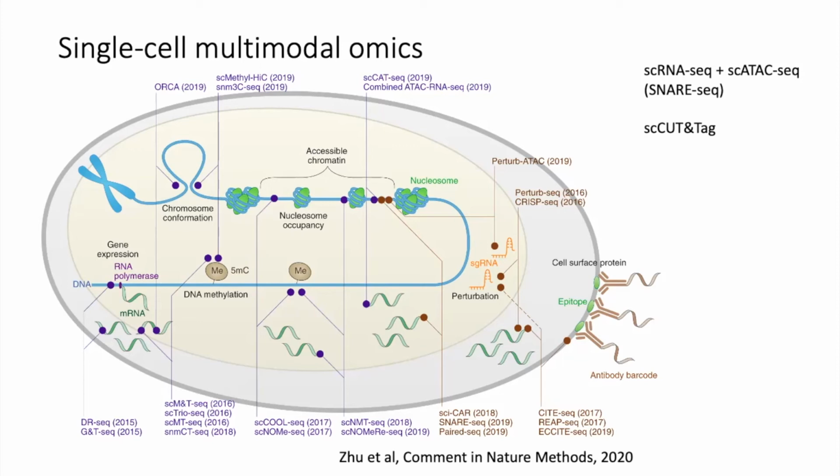But I think they are very specific for your question. But we also have tested now running single-cell CUT&Tag. I don't know if you know about that method, but it's somewhat similar to single-cell ATAC-seq. But while in single-cell ATAC-seq the transposase just cuts in open chromatin, with single-cell CUT&Tag, you can look specifically at transcription factors or histone marks with an antibody.